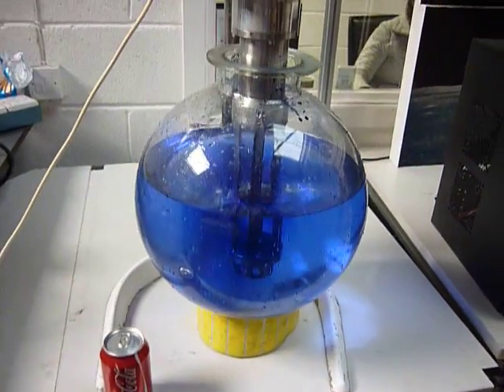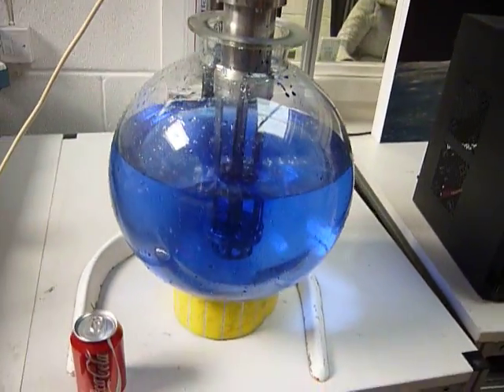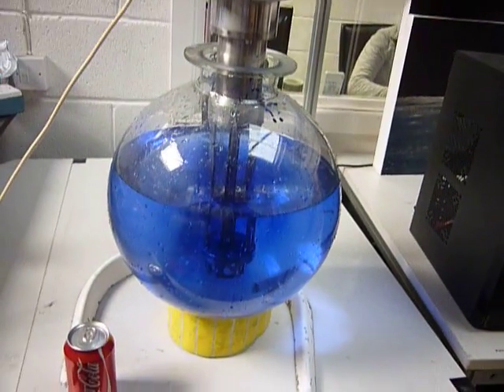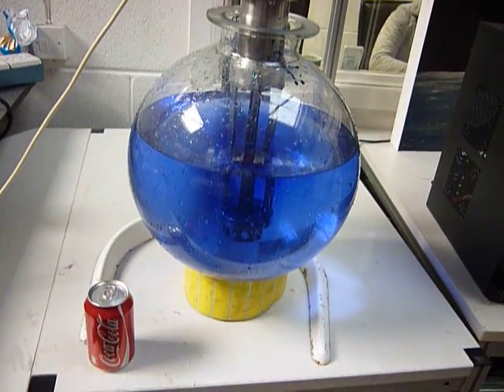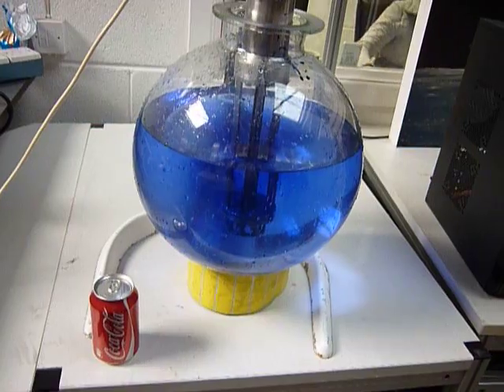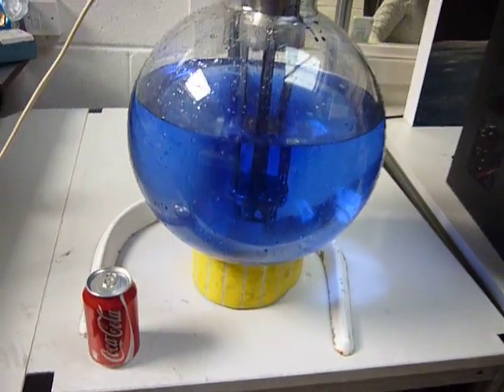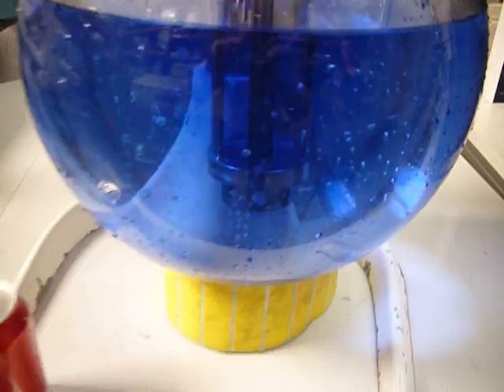What we've got here is a 20 litre reaction flask and you can see that the water has been coloured in there to show the action of the mixing emulsifying head there which you can now see.